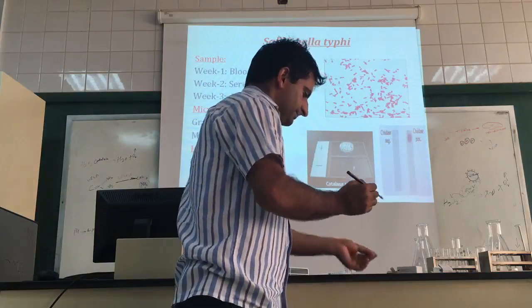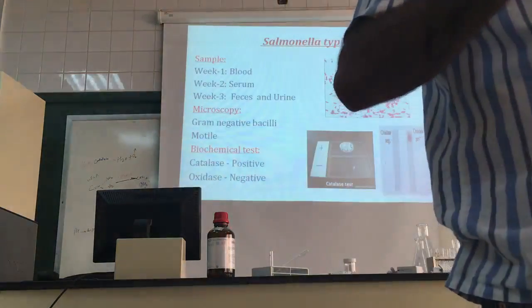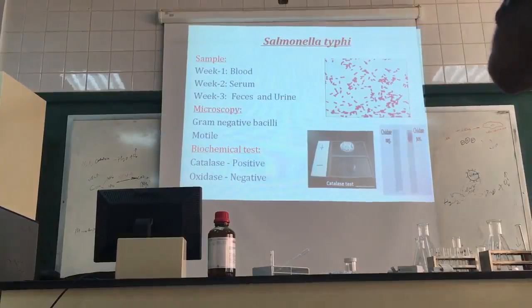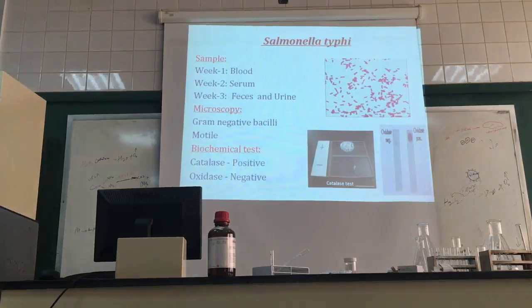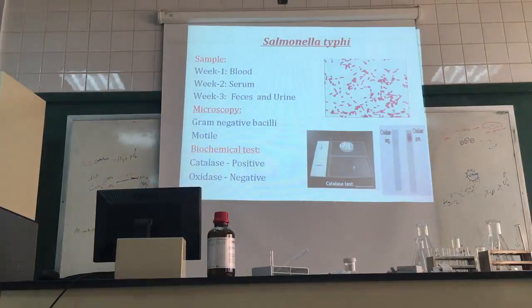And what I will do, some students are closer, they can see, I will put it here. You see bubbles coming out? Yeah. Please come and see. You see bubbles coming out? This means this bacteria has the enzyme catalase and it breaks down hydrogen peroxide into water and oxygen. These bubbles coming out, this is oxygen, okay? Fine? This is catalase positive. This means this microbe is catalase positive.